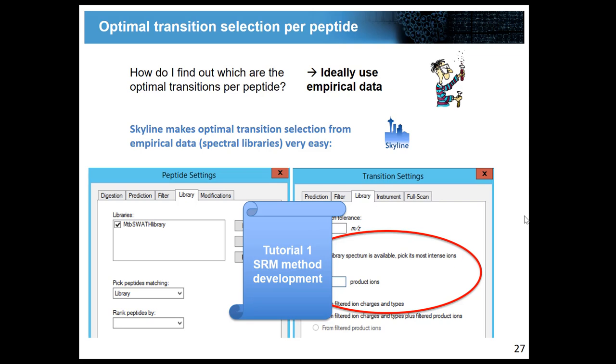But when you have a synthetic peptide and you measure it and you validate peptide parameters, even if it's then just 1 or 2 transitions that are usable, or 3, of course, then once you've validated with a synthetic peptide version, you can choose that. If your peptide is just badly digestible, not stable, if this is the reason why you don't see it, then of course also a very good assay, very good peptide parameters will still not help you detecting it. Okay? Did that answer the question?